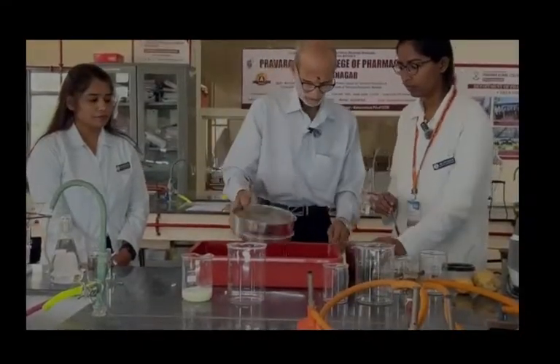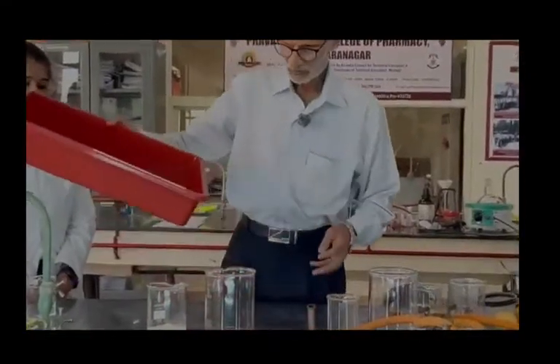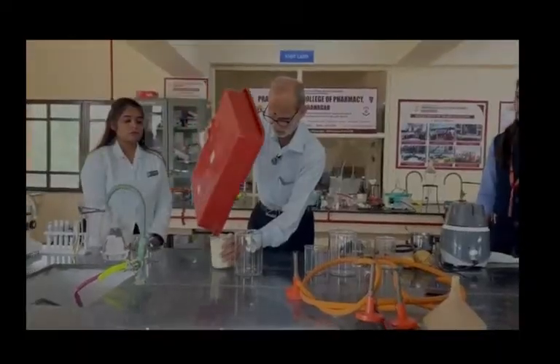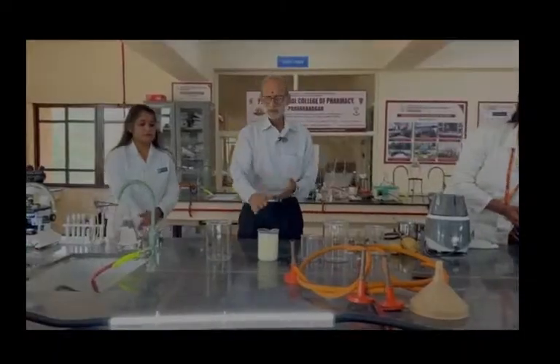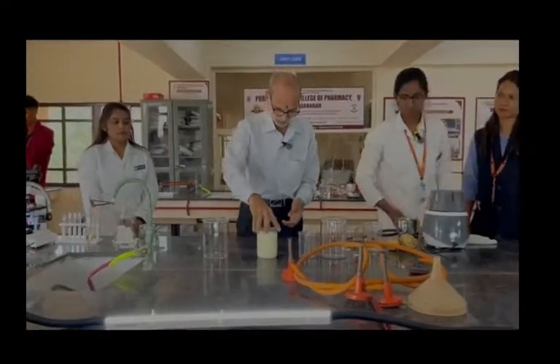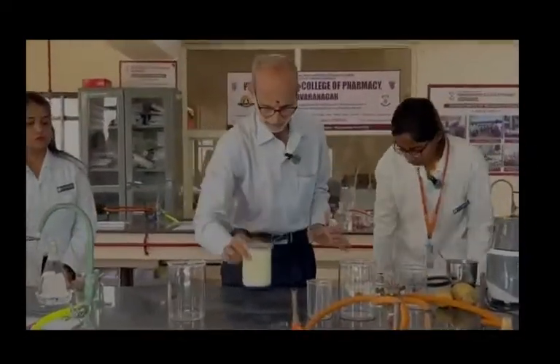We'll discard this now. Discard it. Done. So now you can see here, starch will settle down. The supernatant we will discard and replace. We'll give one more washing with the water. I can see here the starch which is getting settled.